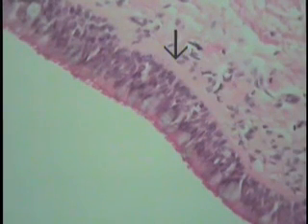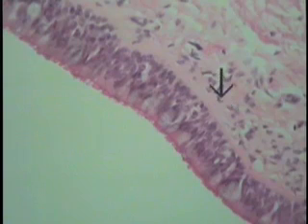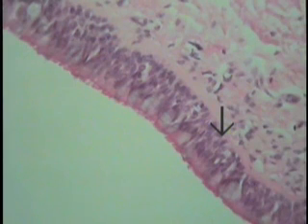This type of epithelium, this pseudostratified columnar epithelium lining the respiratory tree, is indeed simple. That, by definition, all of its cellular components touch this basement membrane. However, not all of the cells reach the apical lumen, and the reason for this is that it's comprised of a heterogeneous type of epithelium. That is, several different cell types make up this particular epithelial lining, all of which touch the basement membrane.